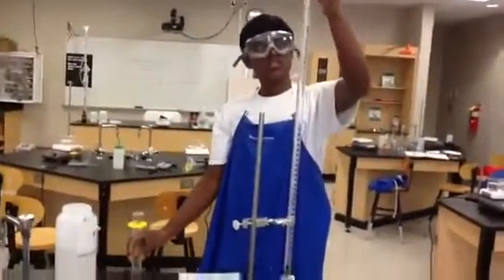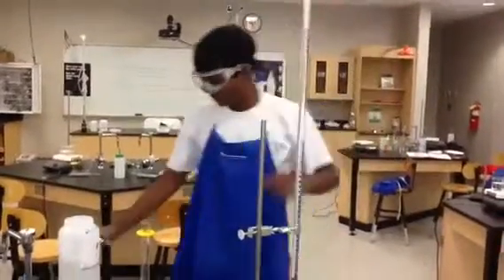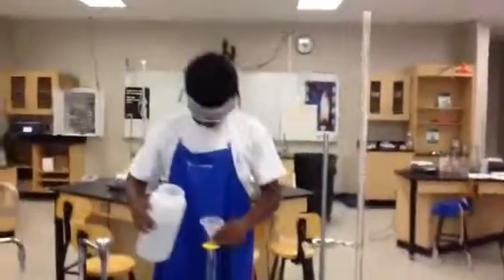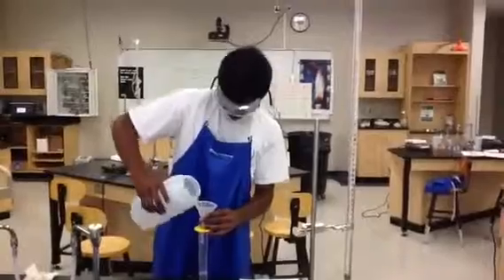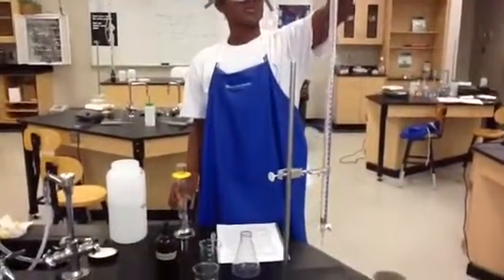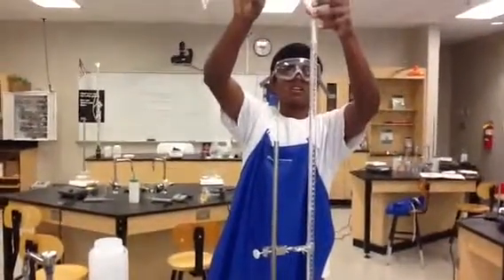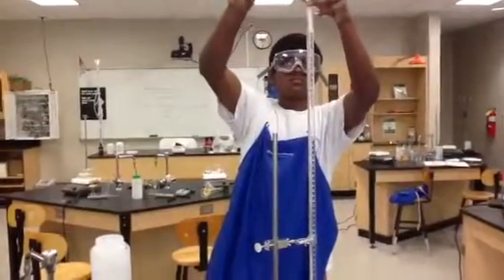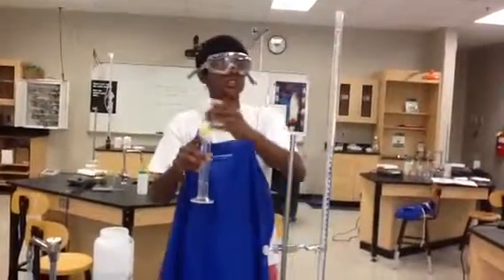And if you can notice, there's just a little bit more to add, so I'm going to add the few milliliters left. And that's 100 milliliters of the base.